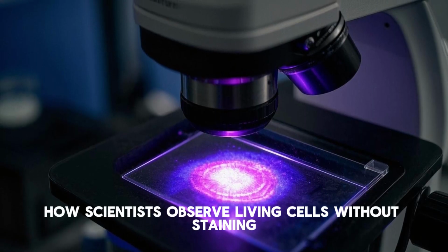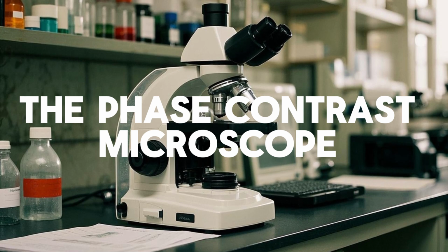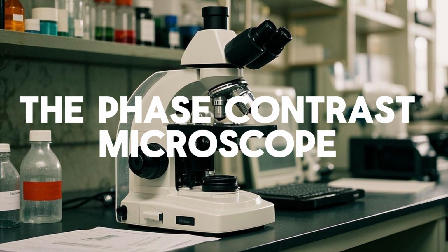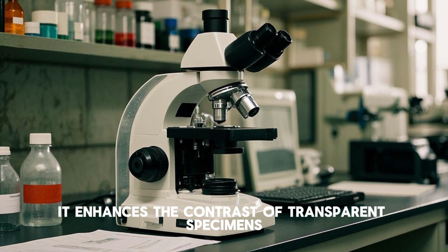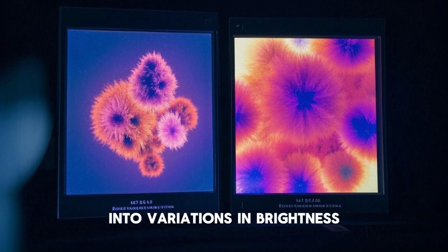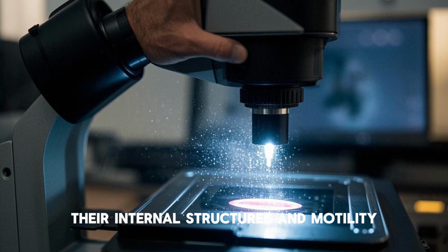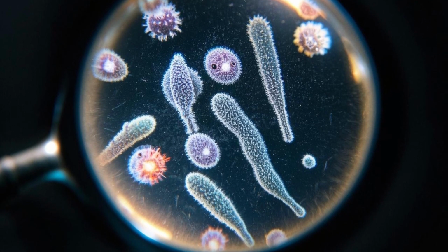Ever wondered how scientists observe living cells without staining? The phase contrast microscope is the answer. It enhances the contrast of transparent specimens by converting differences in light refraction into variations in brightness. This makes it great for viewing live cells, their internal structures, and motility.